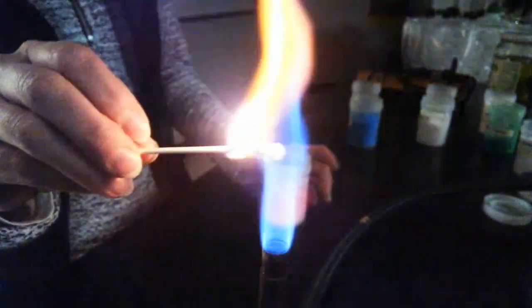but what I see is a yellowy color. Cool. This is usually one of the most fun labs, and I feel so terrible that you can't do it yourself. Playing with colored fires, gotta be a good thing, right? Maybe, kind of. Okay, so that was lithium chloride, then calcium chloride. How about, let's try potassium chloride.